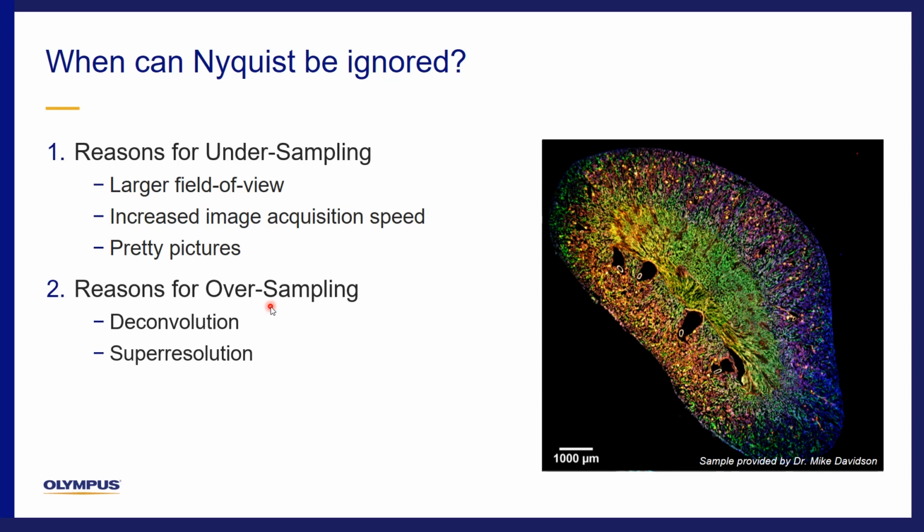If you want deconvolution to work very well, you actually need to give more data to the image than Nyquist sometimes provides. So zooming in past Nyquist could be great for deconvolution. And it's also used routinely for any of the various techniques out there of super resolution. That is a way to achieve greater resolution than a microscope and objective can ordinarily attain.